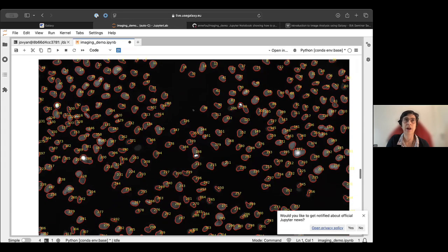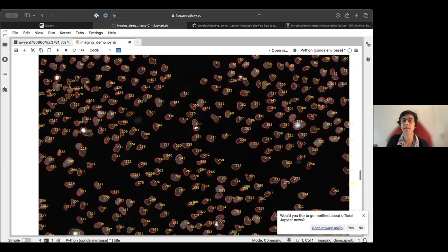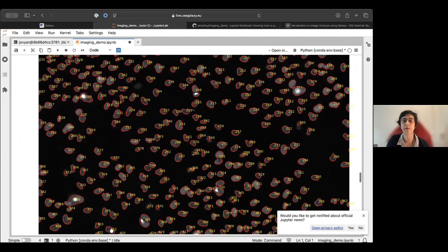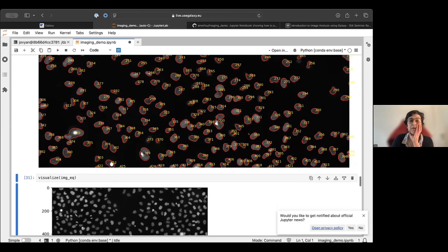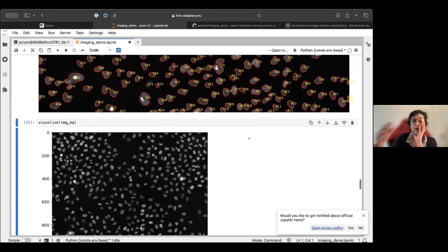Yes. So now we have something which is very similar to what you had in the pipeline shown by Leonid, like a label with a number for each of the cells. And we took an image where it worked relatively well. And here you can see a bit the different steps you would have to do, for instance, if you wanted to improve this workflow and this tool and create a new tool in Galaxy. But you can do many other things because, of course, it's fully flexible.